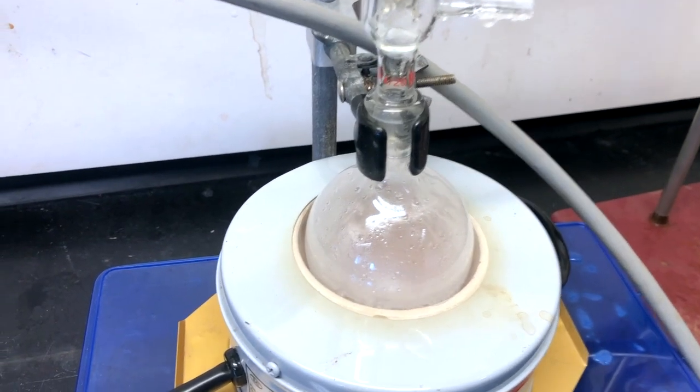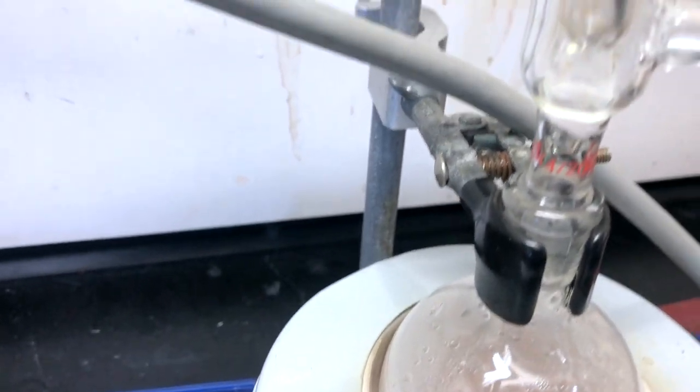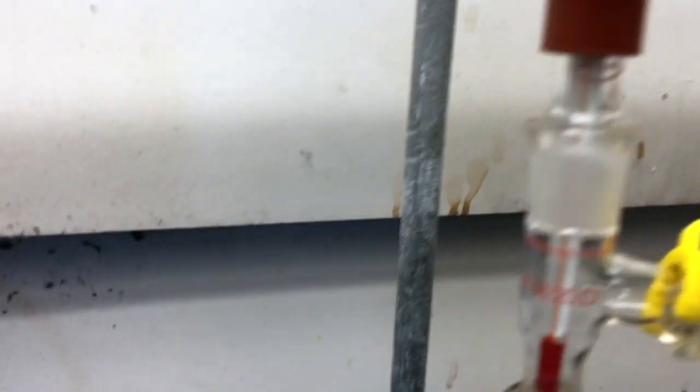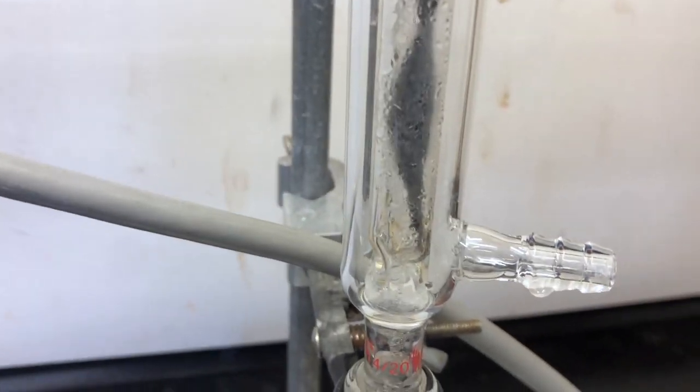After a bit, the liquid begins to boil. We want it to boil very slowly this time, so that vapors entering the fractionating column have time to condense and evaporate multiple times. We have to be very patient — it can take 15 to 20 minutes for vapors to reach the very top. You can see vaporization and condensation taking place about halfway up the column.